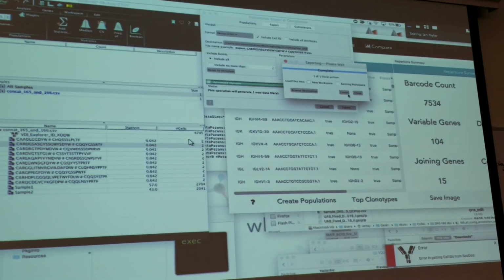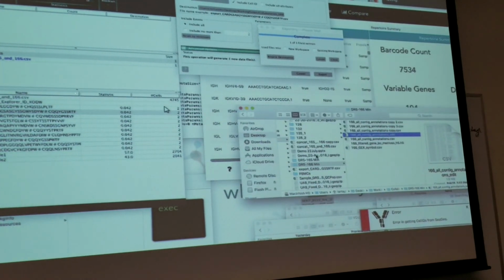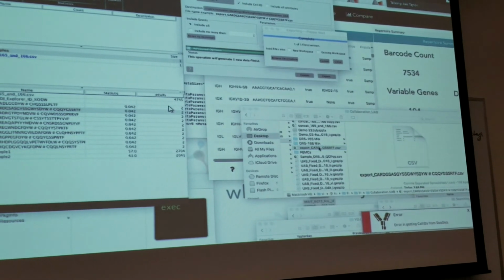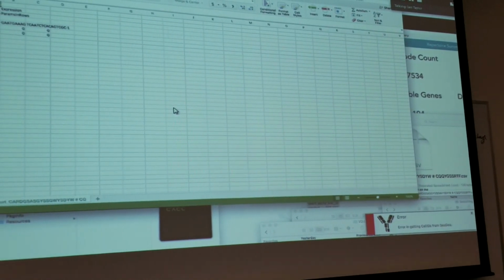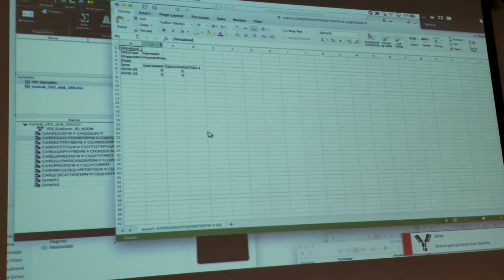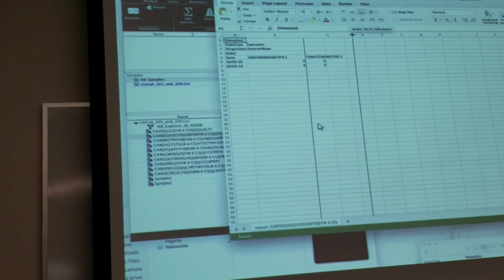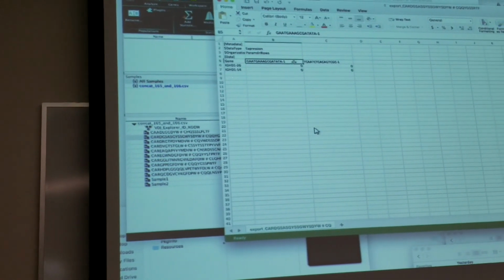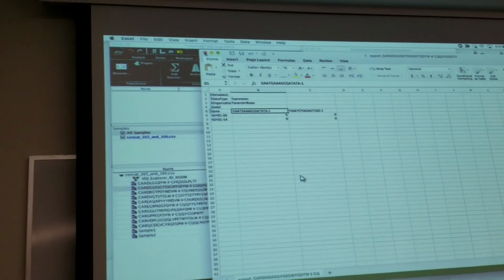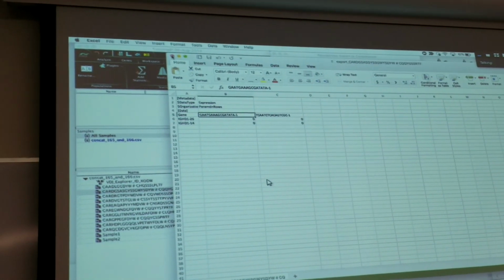And I can open this into a new workspace, but we actually want to see this is our CSV file, so opening that up in Excel. We didn't have any values for those 2 genes. But here's the cell IDs for those 2 cells. I see. So that should give us back the cell ID. Oh right, and then from that you get the heavy and light chain. Go back to that and in the database.